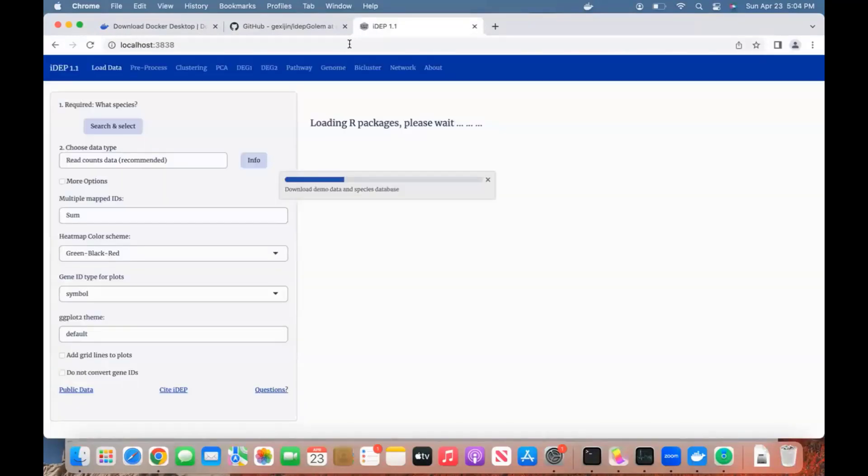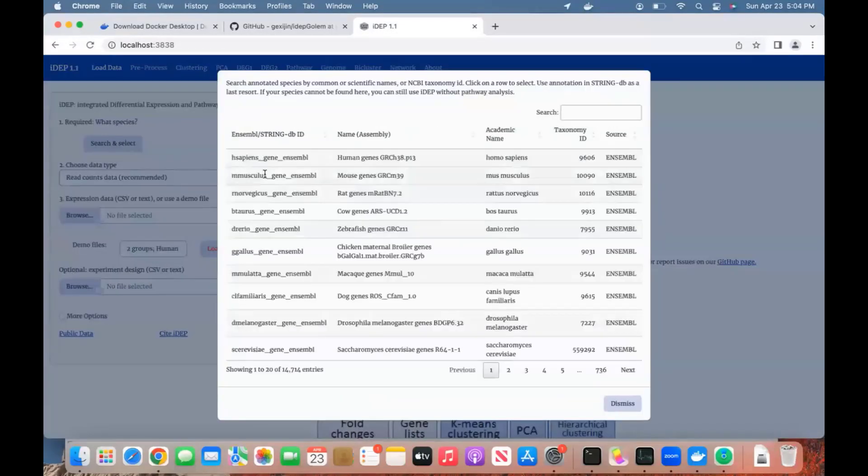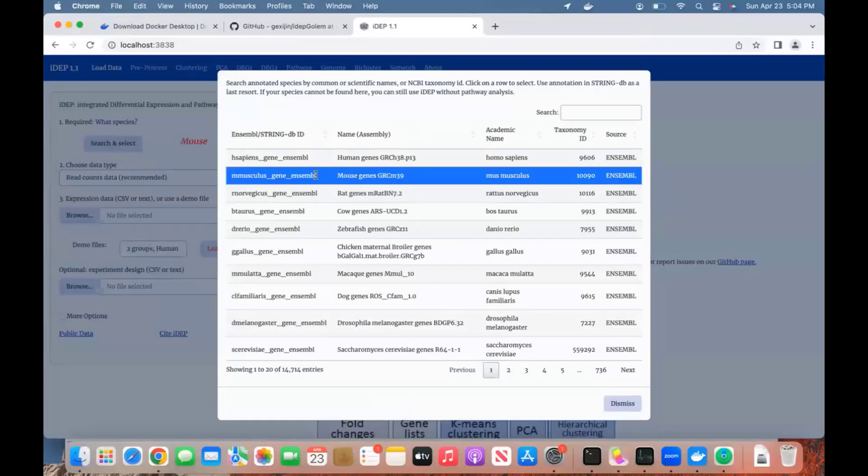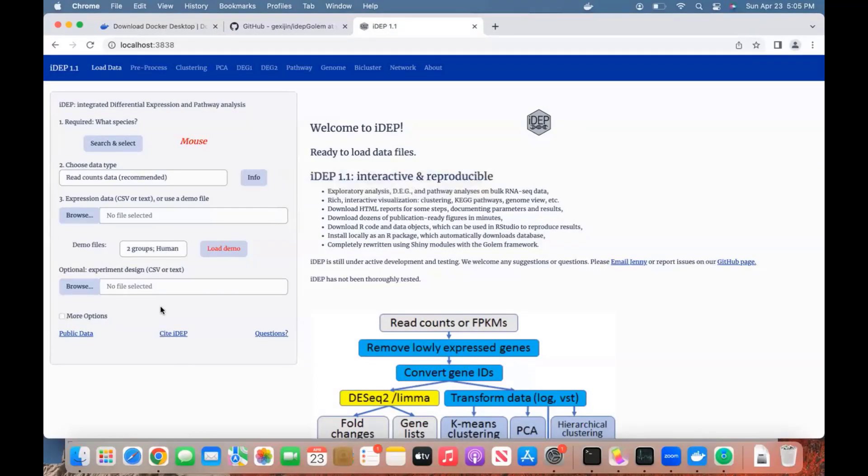Okay, it's coming up. First, it downloads the database. You can select your organism. It starts to download the database for that specific organism, and this could take five minutes. Okay, it's finished.